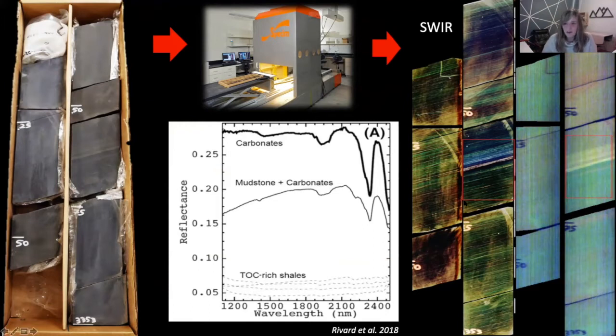One thing I've just highlighted here is an interval where you can see that this has actually highlighted this region just in this zone right here. I hope you can see my pointer, otherwise this is not going to make a whole lot of sense. But what's highlighted in the box there basically is showing this interval here that has some pyrite in it.